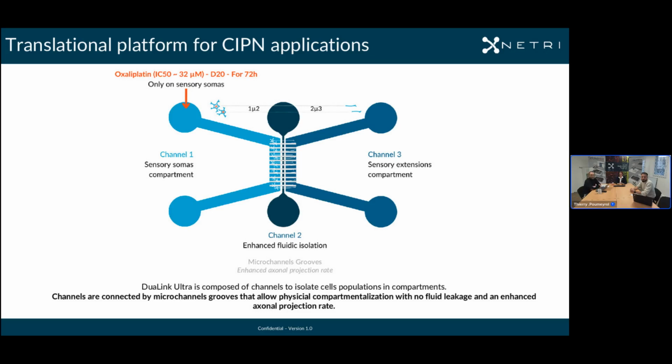Similarly, we use the same architecture, the same neurons, and the same time point. The only difference is where we apply the compound. This time it was applied in channel 1, where you have the sensory soma.